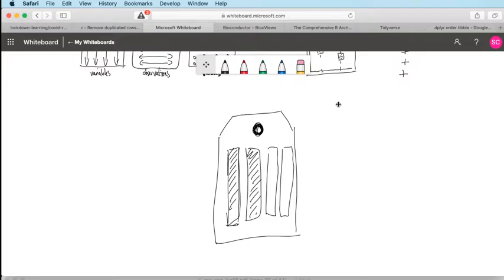The NextSeq has a single load point, and all of the libraries get loaded from that single load point. So you load your flow cell from that single point, and the microfluidics takes your libraries into your 4 lanes. So whatever you load at the top ends up on all 4 lanes, a mixture of it.